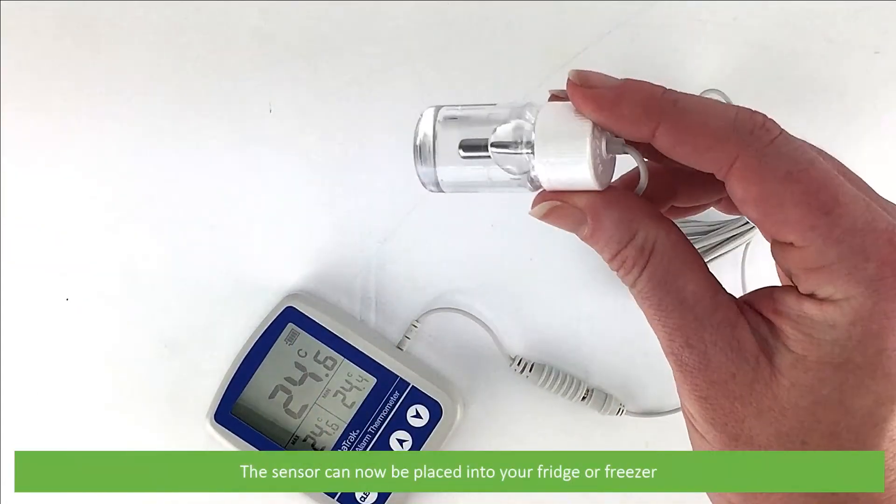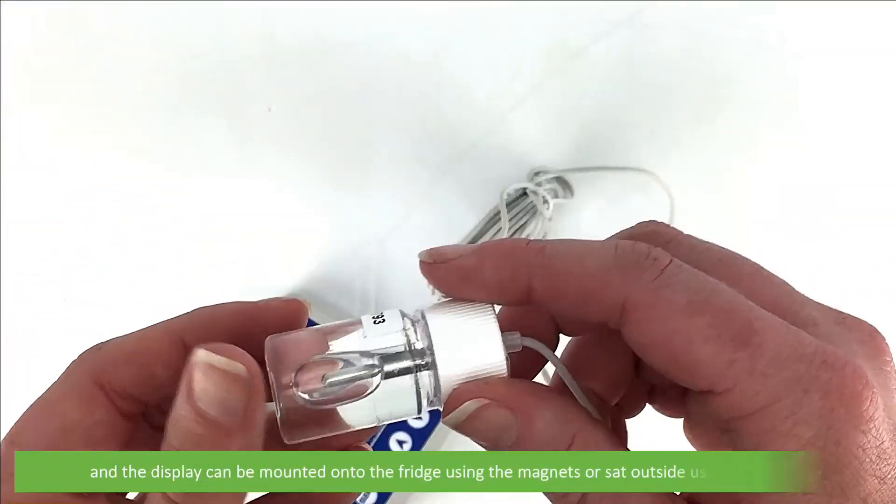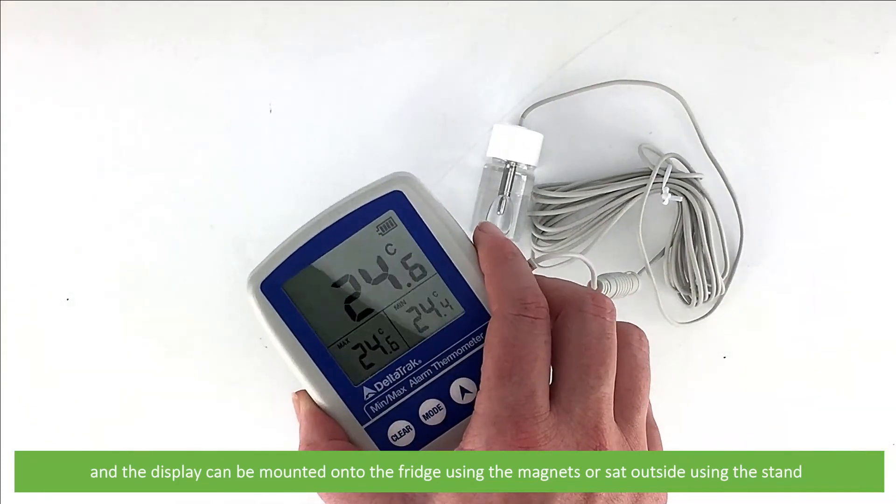The sensor can now be placed into your fridge or freezer, and the display can be mounted onto the fridge using the magnets or set outside using the stand.